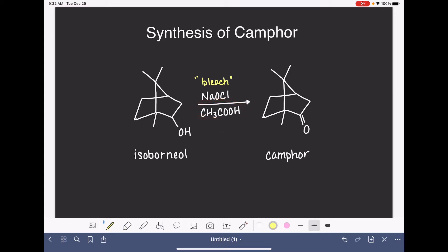The acetic acid that we're going to be using is referred to as glacial acetic acid. Glacial just simply means that it is concentrated. That's a term that we only apply to acetic acid. Glacial is the word that we only use when we're talking about concentrated acetic acid.